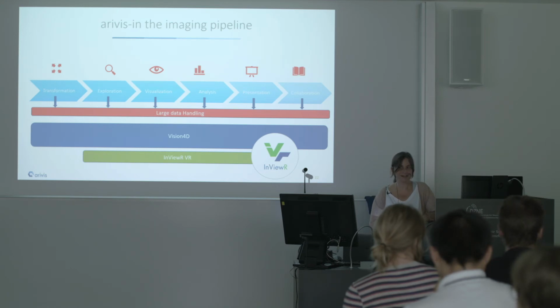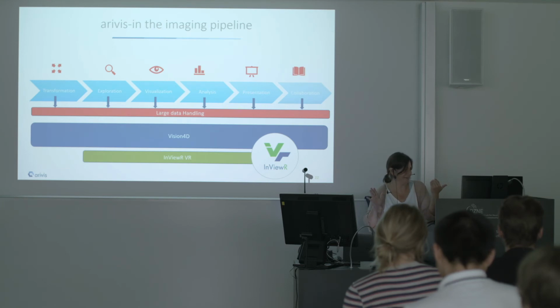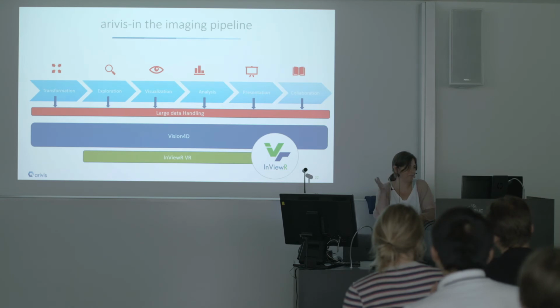Yeah, but I think I should first understand what the reasoning is about, because you wouldn't be doing that for a complete, let's say, complete volume. You don't want to do that, but exactly, yeah. It's available. Even if you mouse over, you get the intensities. We will go into that later.